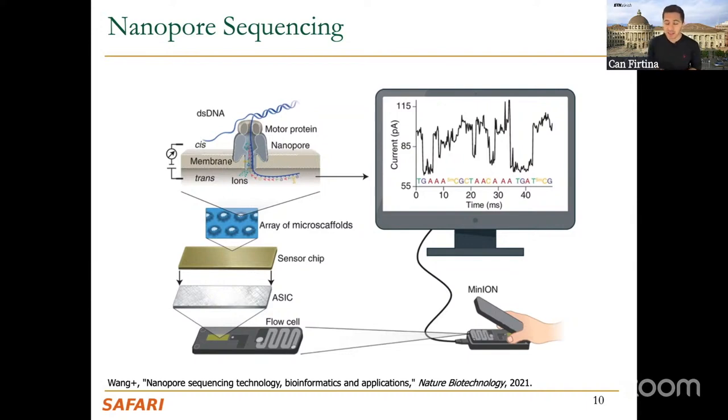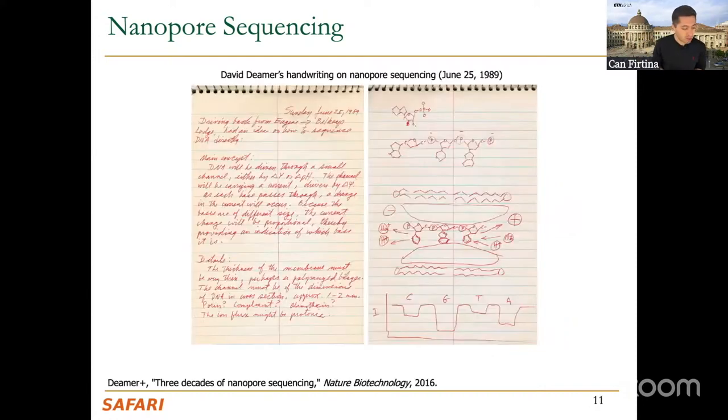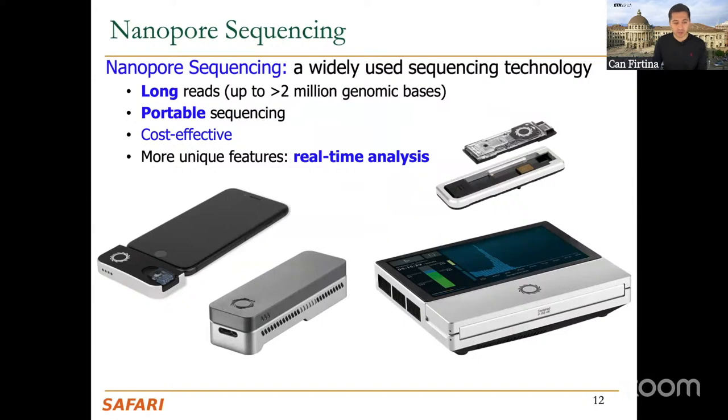And since we have sufficient technology now, we can take 5,000 electrical samples per second. This means that we can actually take 10 samples per base. This means that you have maybe enough information to look at the disruption that each base is causing in these pores. So this was basically the idea in nanopore sequencing, and this is how we improved it over time.